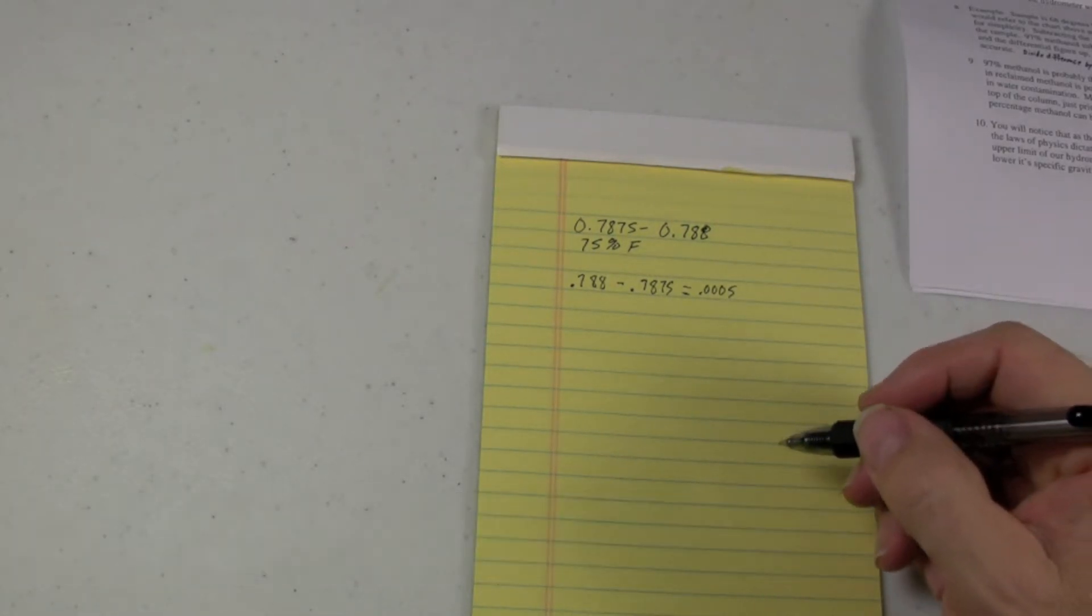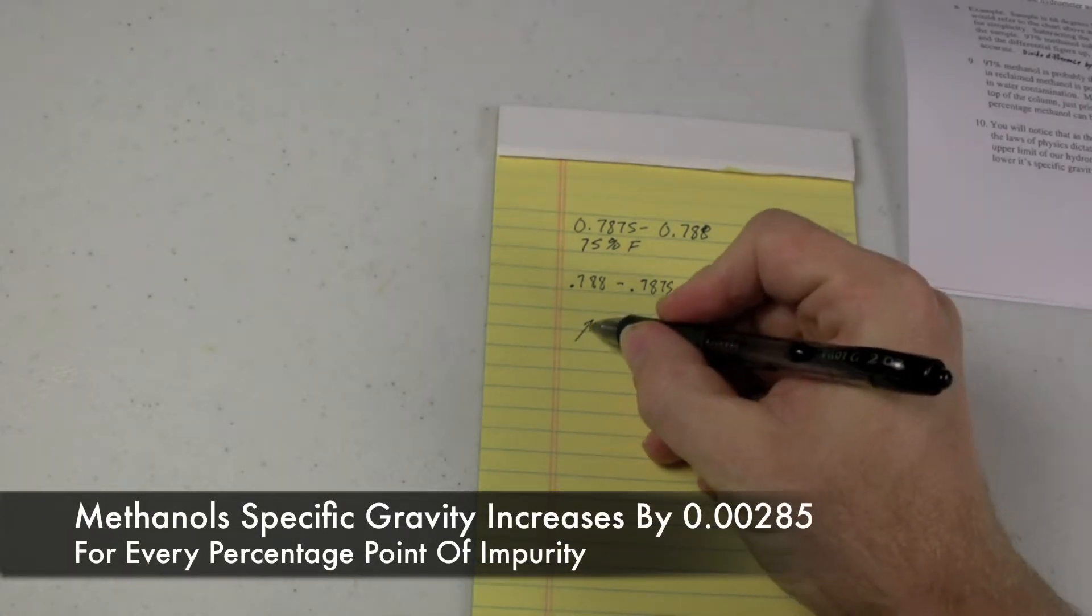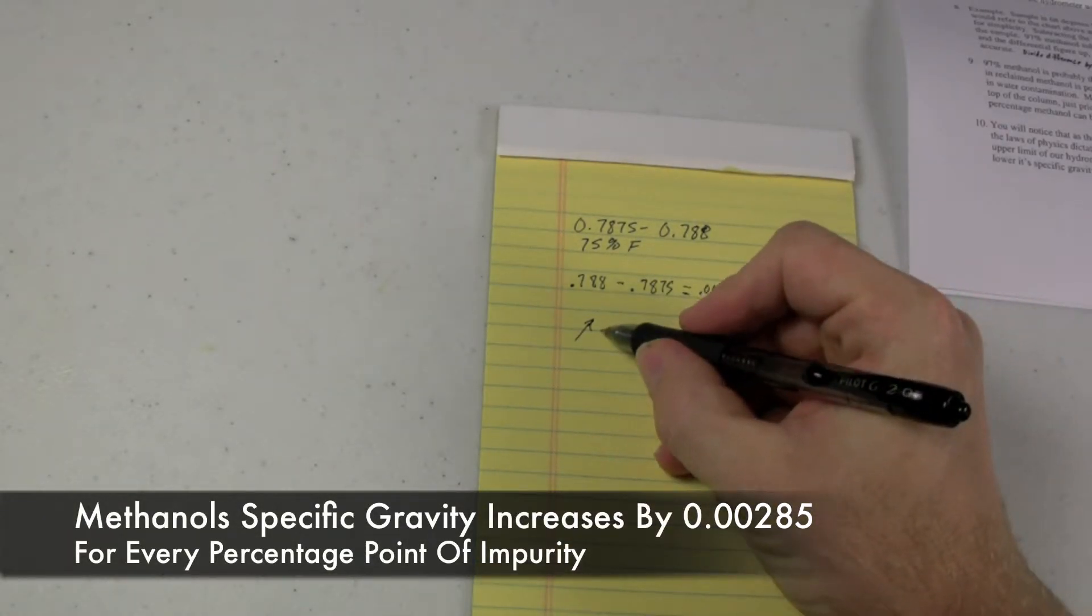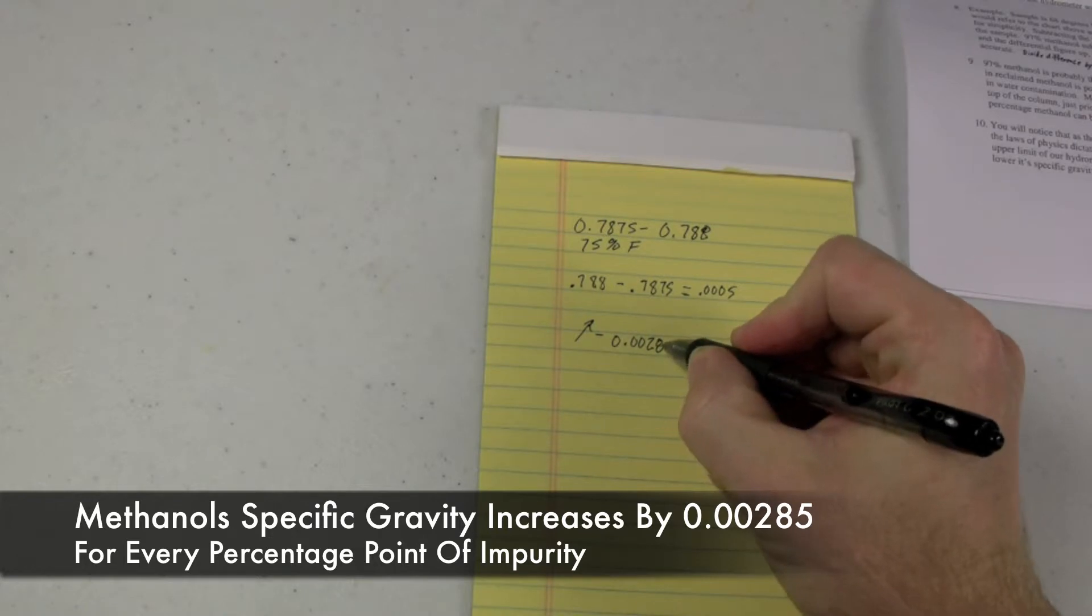Methanol, as it becomes impure, for every percentage point of impurity in methanol, its specific gravity goes up by 0.00285.